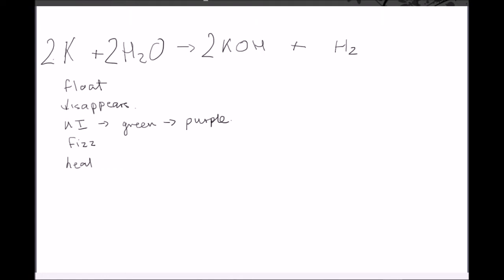Huge amount of heat produced in this instance, even more so than in the previous reaction. The whole reaction could certainly be described as being very vigorous. Okay, it's highly reactive. This is why you store sodium, if it's found in the lab, in a jar or a bottle under oil to prevent any water or oxygen getting to it. And that's really about the height of it. Again, we can correlate the potassium hydroxide to the purple.